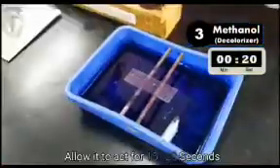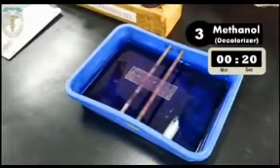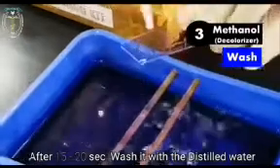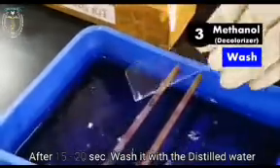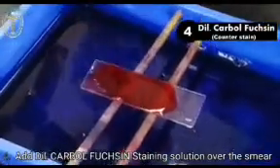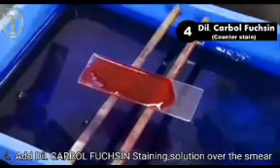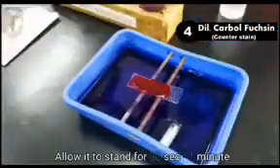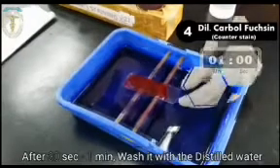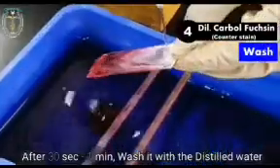Methanol is very powerful, so you reduce the time to 15 to 20 seconds, and wash off with distilled water. After that we add dilute carbol fuchsin and leave it for about 30 to 60 seconds, then wash off with distilled water.